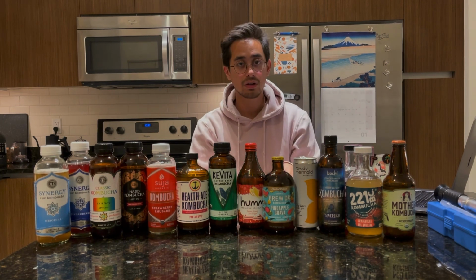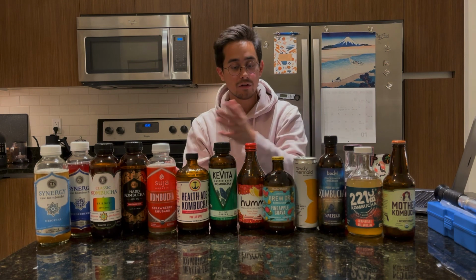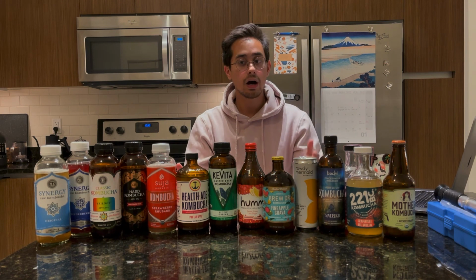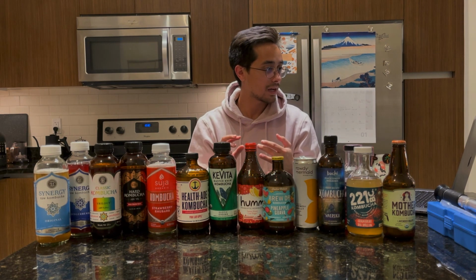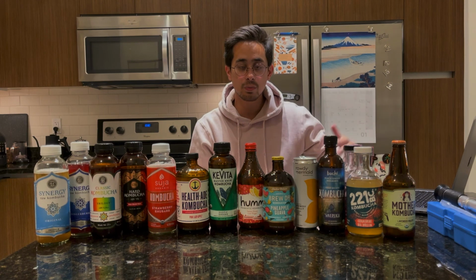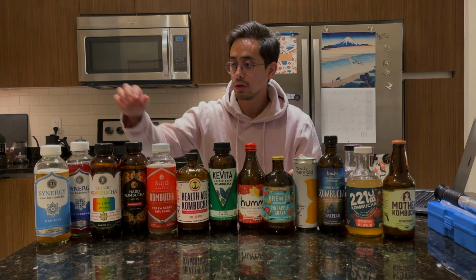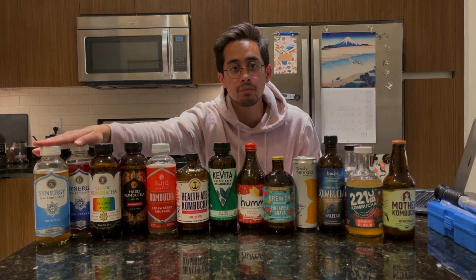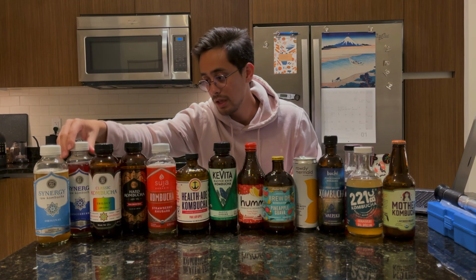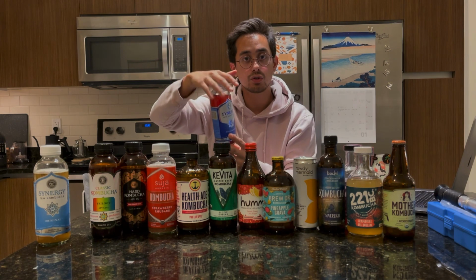So one interesting thing to note is the largest discrepancies between what the label said as far as how much sugar it had versus what I measured through the refractometer came from pretty much all of the GT's kombuchas and Health Aid. You can look at the spreadsheet, I'll link it in the video here. But GT's, the original here, the gingerberry, both came out about 9 more grams of sugar than the bottles say. They both say 12 grams of sugar. I measured around 21 grams of sugar.